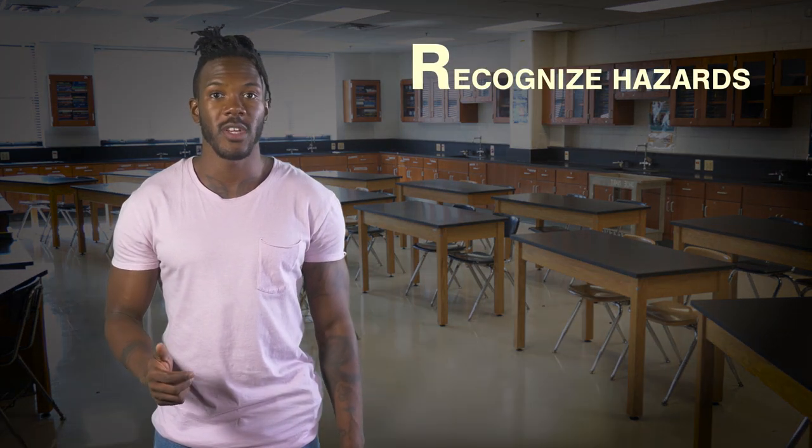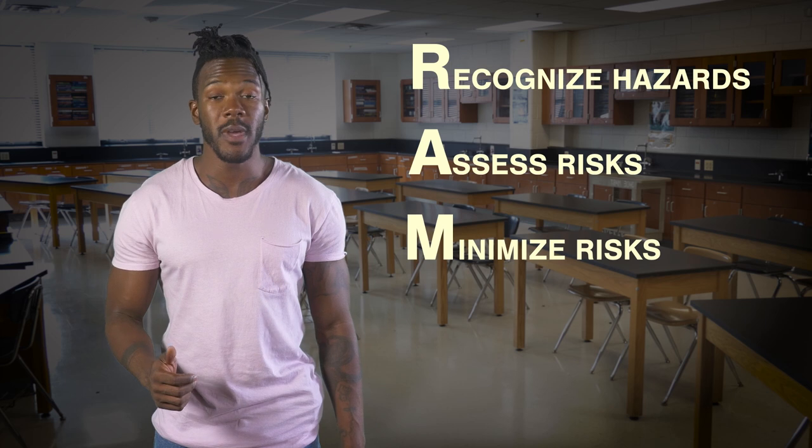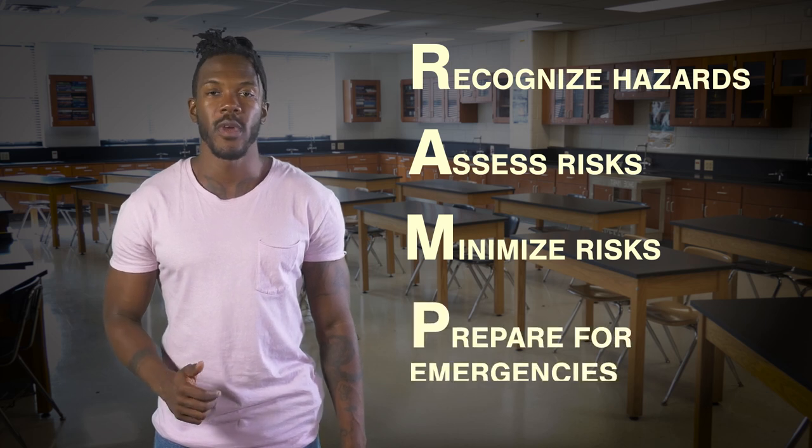In this video, I want to share a simple yet powerful tool for protecting you and your classmates in the lab. The tool is called RAMP. RAMP stands for R, recognize hazards, A, assess risks, M, minimize risks, and P, prepare for emergencies.